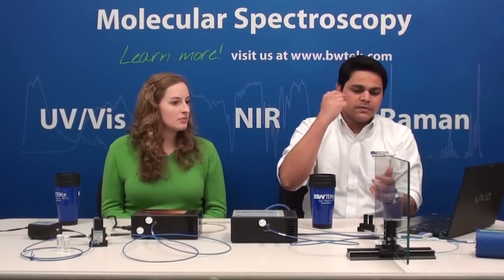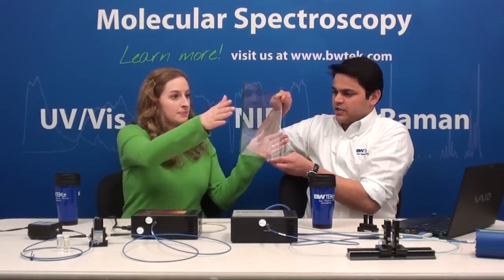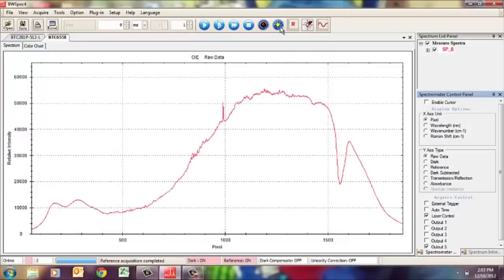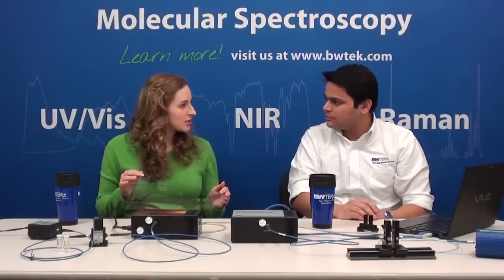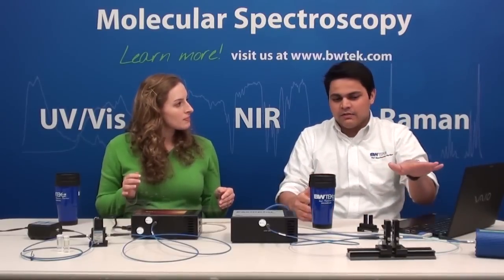I've just collected a dark spectrum. Now I'll take the glass pane out and collect a reference spectrum. Since transmission is the percentage of light that passes through a medium, in the absence of a medium you have 100% transmission. To actually measure transmission through a medium, you need to calibrate the spectrometer so that it measures 100% transmission first.